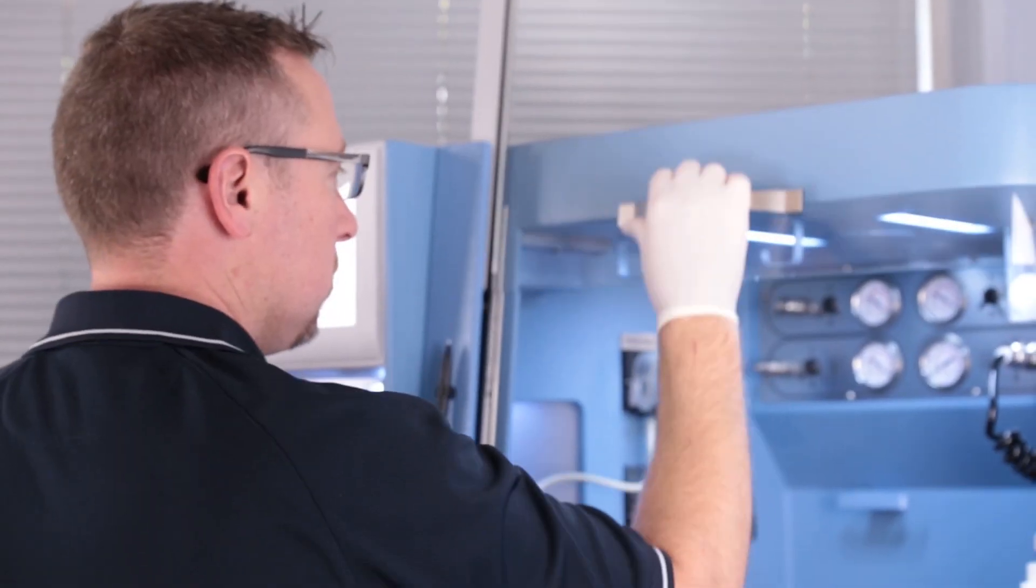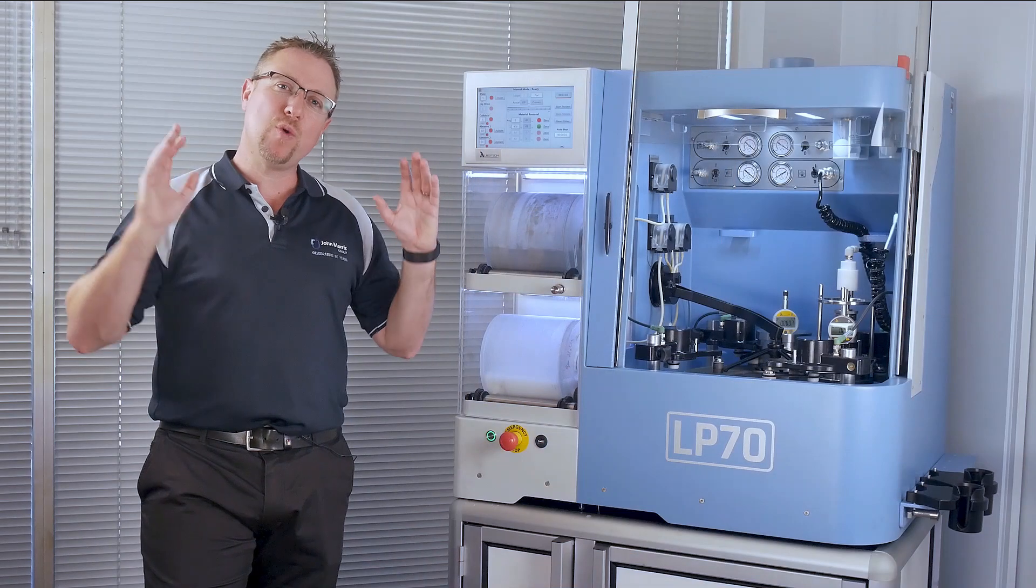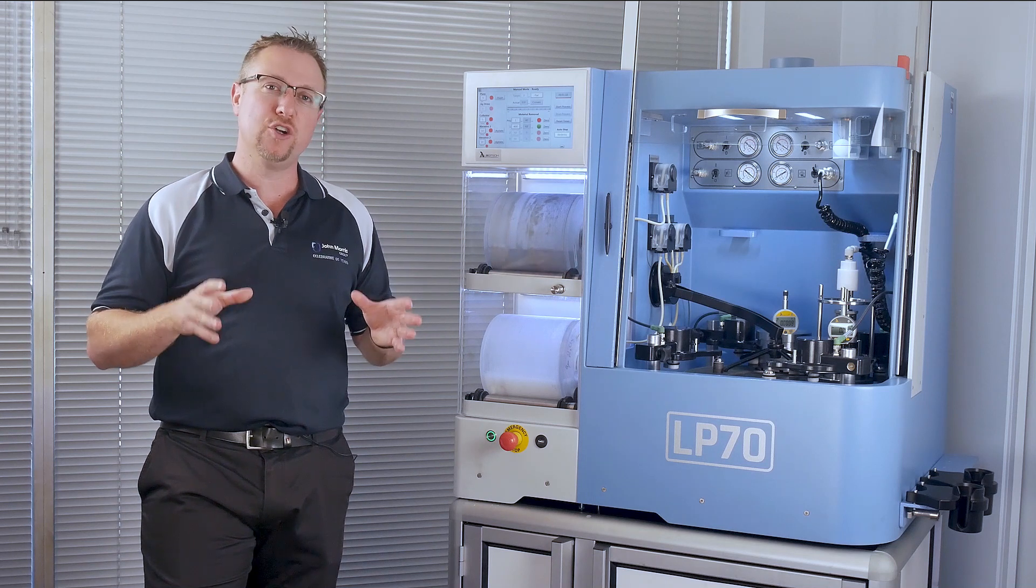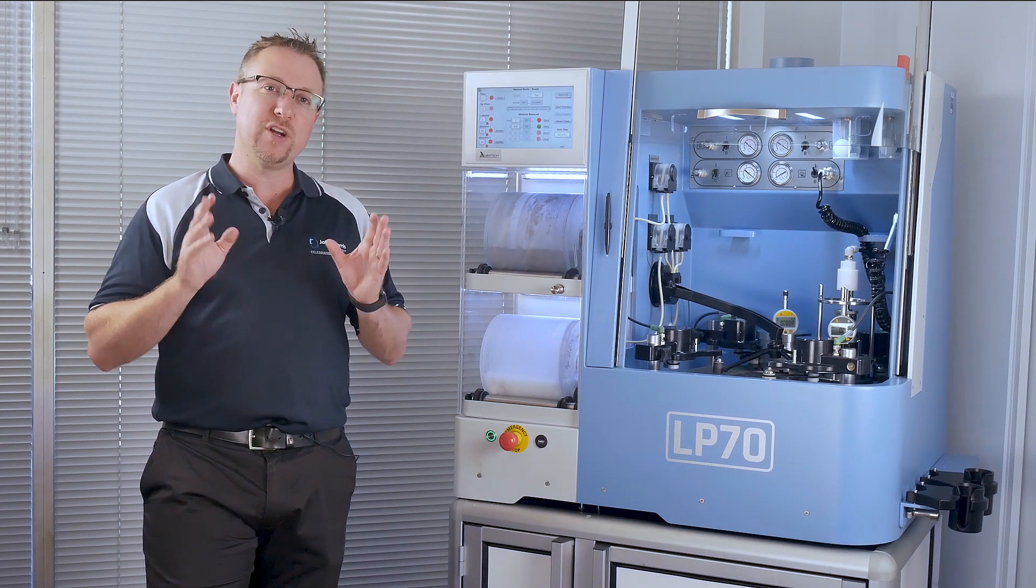As you can see, there's an integrated fume hood to protect the users from any hazardous materials or nanoparticles which may be generated during the process. And the process can be recipe driven or manually manipulated during the process development so that you can get a perfect run every time.